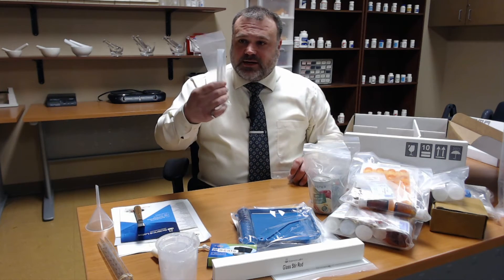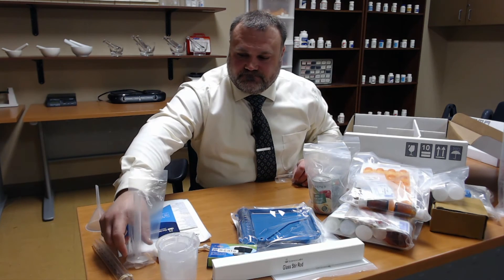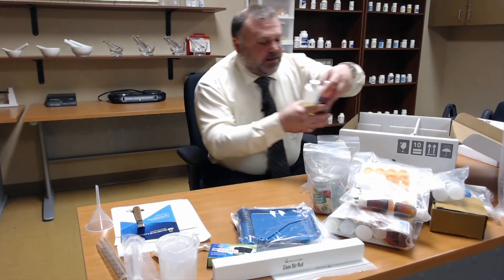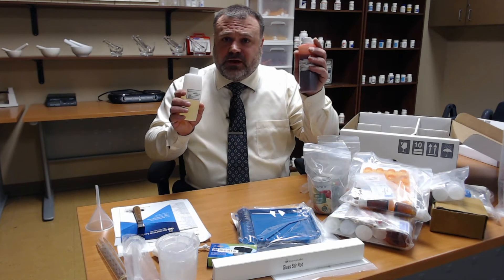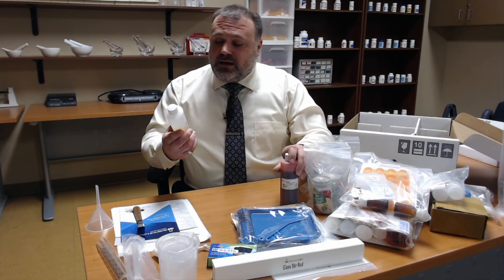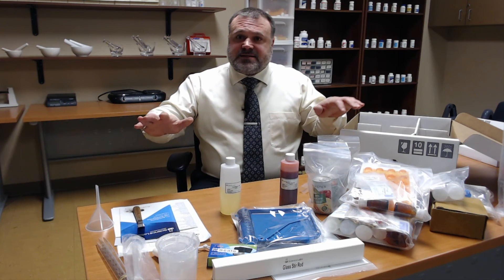We also have a smaller graduated cylinder. And finally, two more liquids for compounding: we have our cherry syrup for compounding our syrup — most syrups are going to be flavored and sweet, so they have sugar in them, and we have to be careful with diabetic patients. And then vegetable oil. So that's the kit in general.